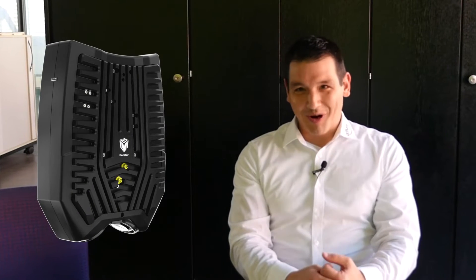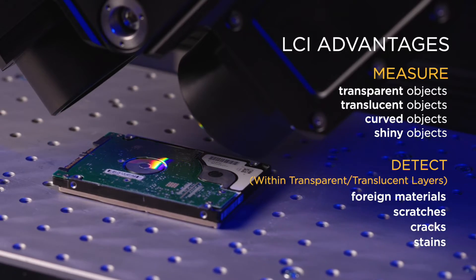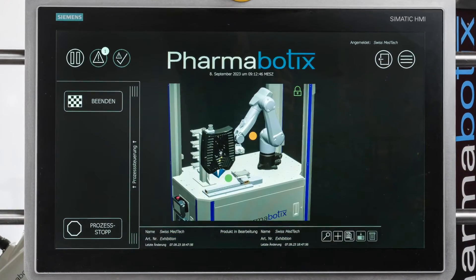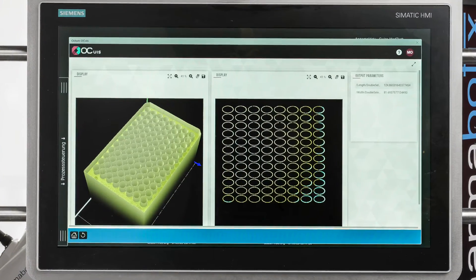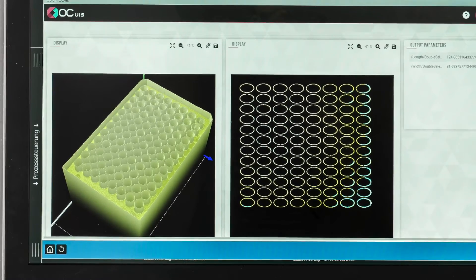For this application there's only one sensor on the market and this is the 5516 from LMI, the GoCater sensor. The next step of course is to use our own software solution OCBIS to do a good evaluation and get good measurement results.